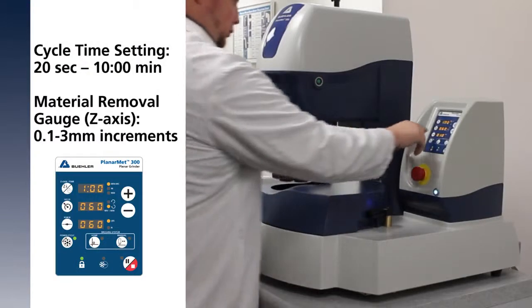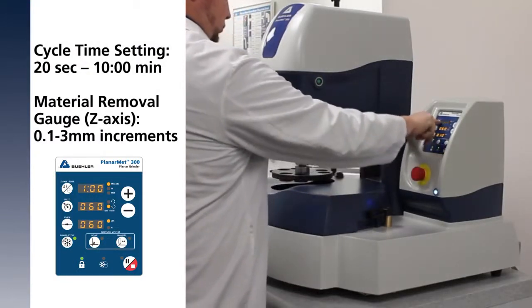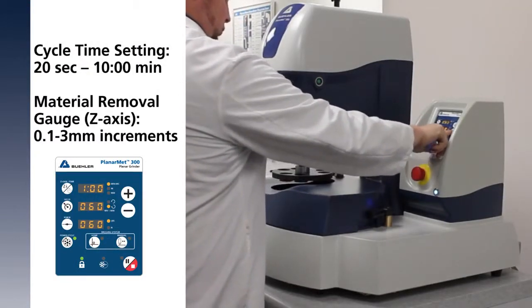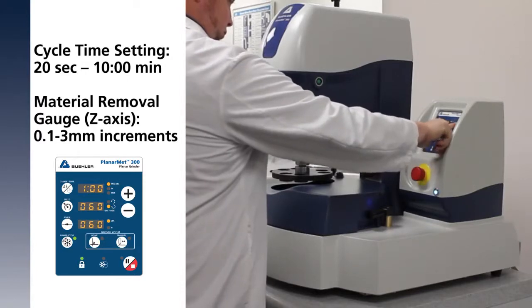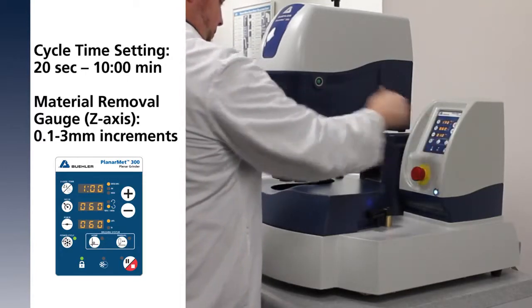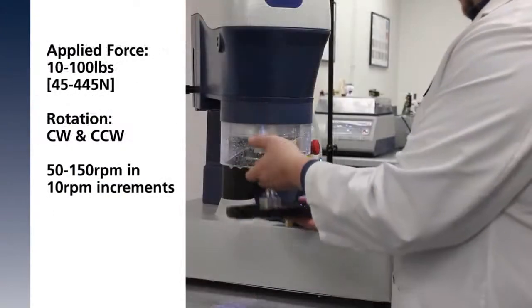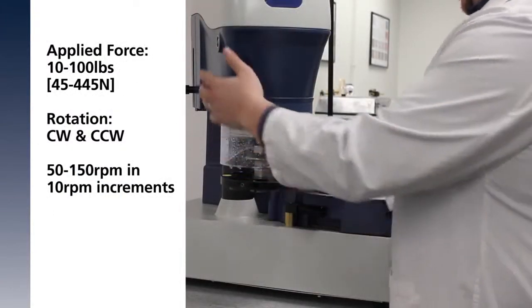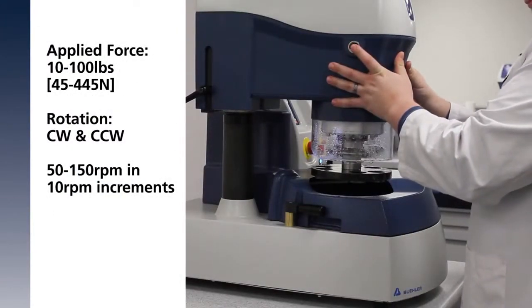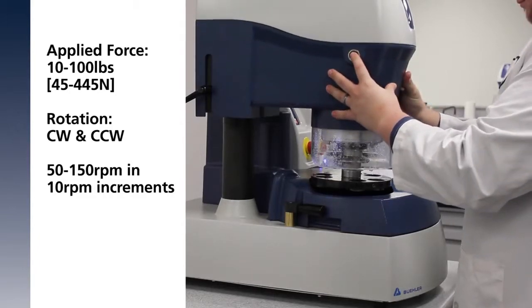Select your preferred grinding mode on the control panel, quickly choosing between a timed cycle or the Z-axis mode for controlled material removal. Load your specimen holder, select an operating mode, and the specimens are full-plained in one to two minutes.